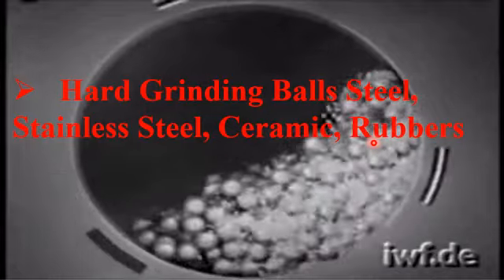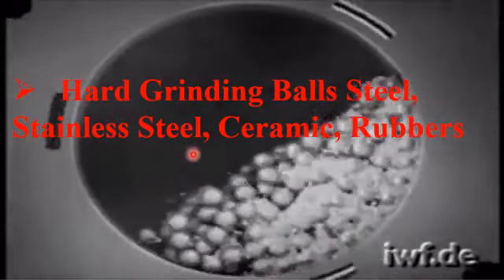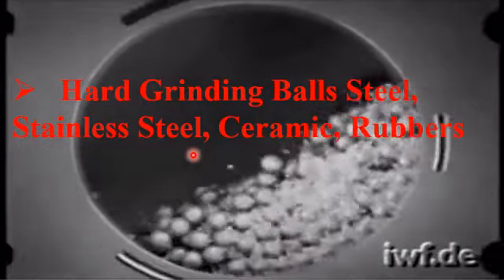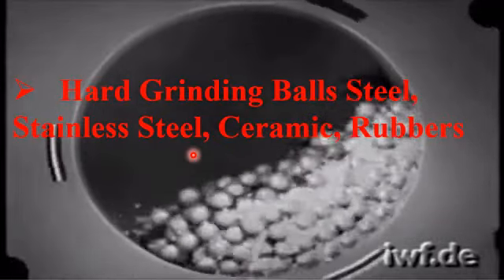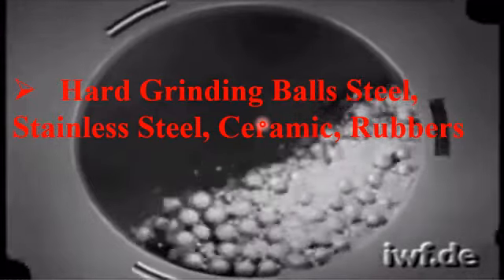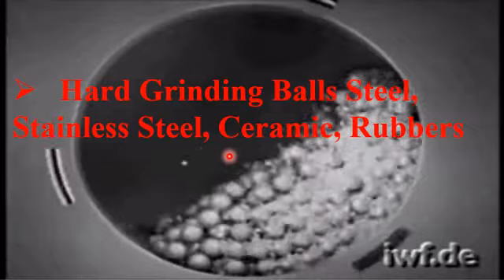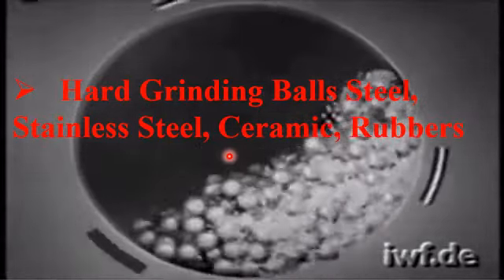However, in case of hard materials, steel, stainless steel, or ceramics like zirconium oxide are used to convert the hard material into a nanopowder. So the balls inside the ball milling drum are chosen based on the material which you want to crush.